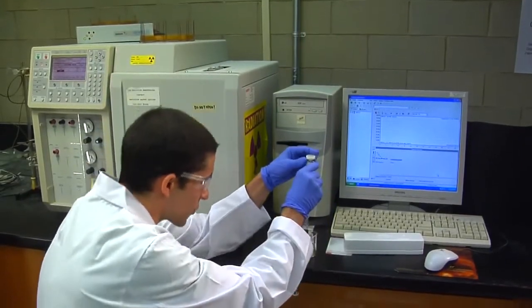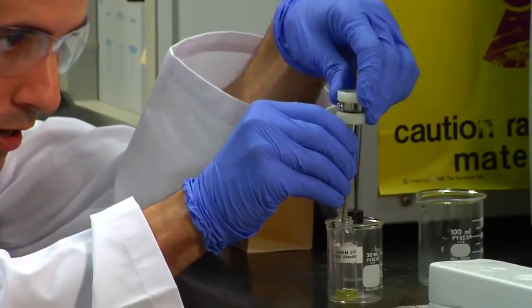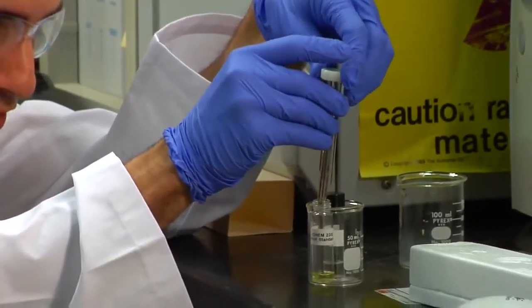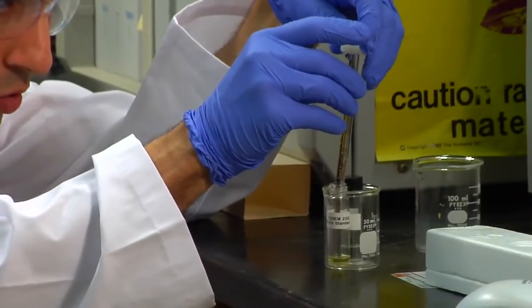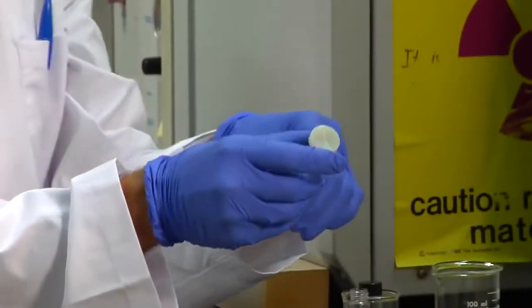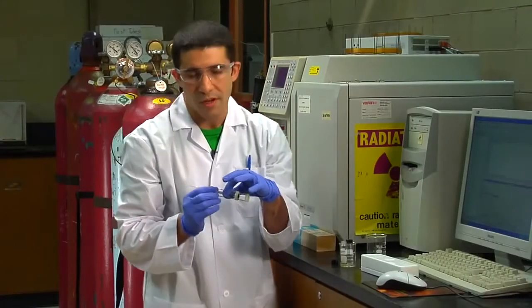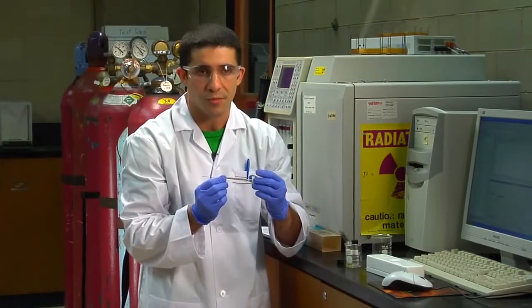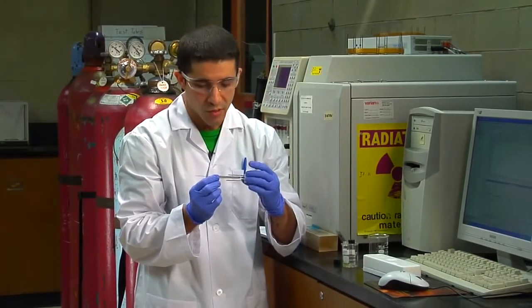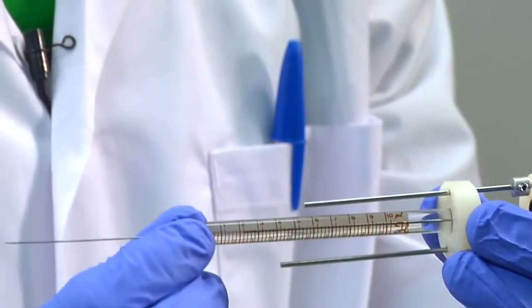To do that, you just slowly place the syringe inside the vial and slowly take up your sample. It's best to do this as slowly as possible, as if you take it up too quickly, you may introduce an air bubble. It's a 10 microliter syringe, but the GC typically takes injection volumes ranging between 1 to 2 microliters. So I have about 2 microliters of sample here. And at this point, you're ready to perform your injection.